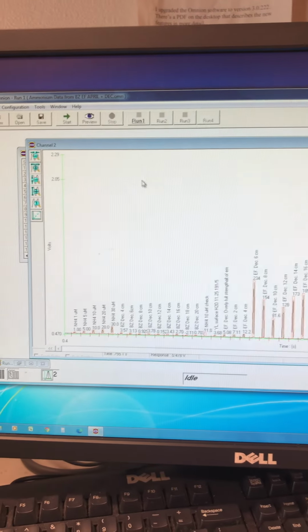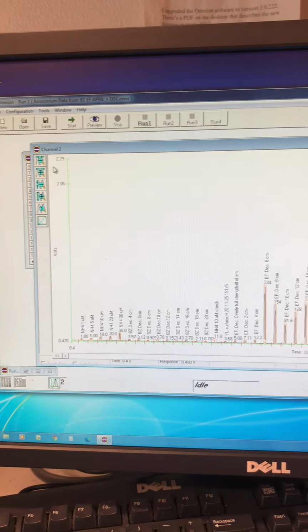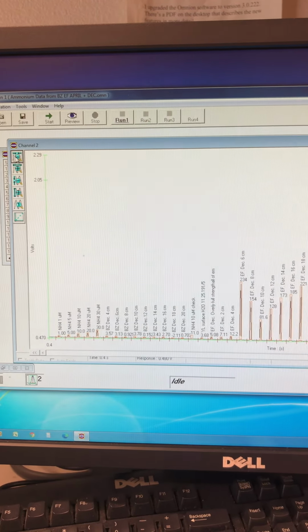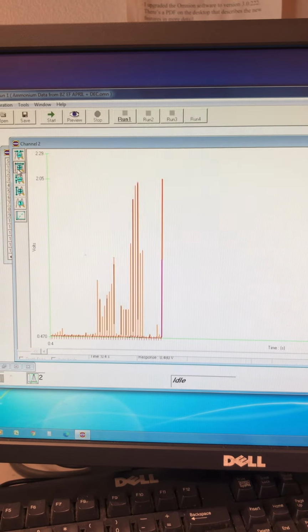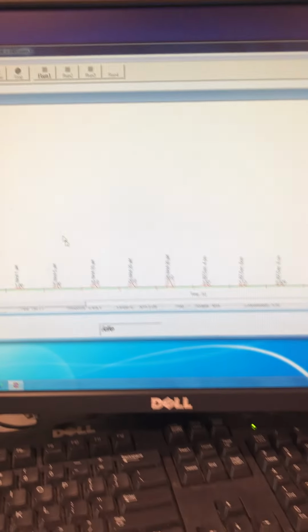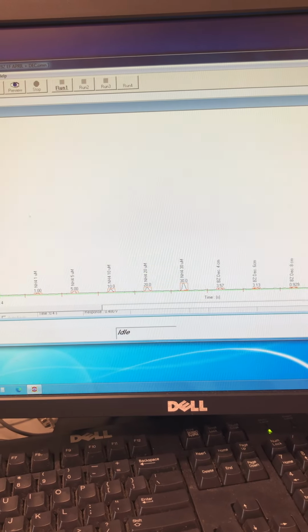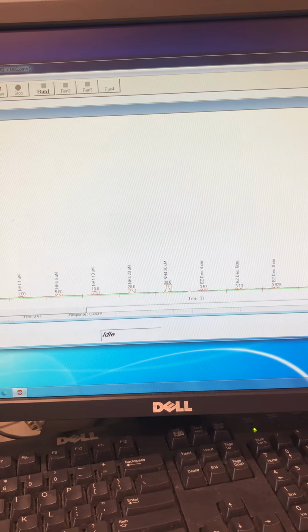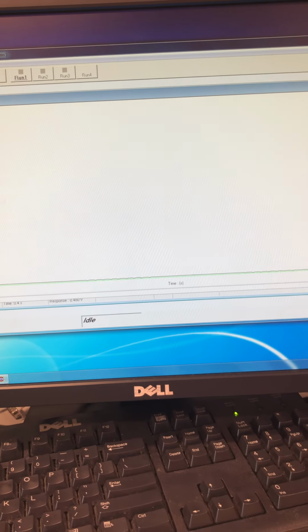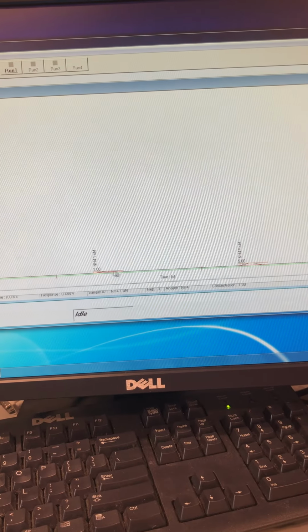Here is an example of when we actually have data in a run, and let's say we want to zoom in or zoom out on the data. There we go. So we've now zoomed in somewhat. We can zoom in further. This is making our distance, so that went too wide. So now we can see the type of width the peak has.